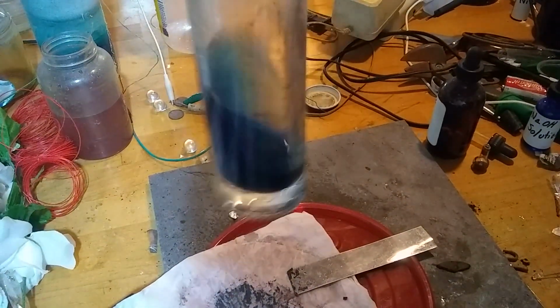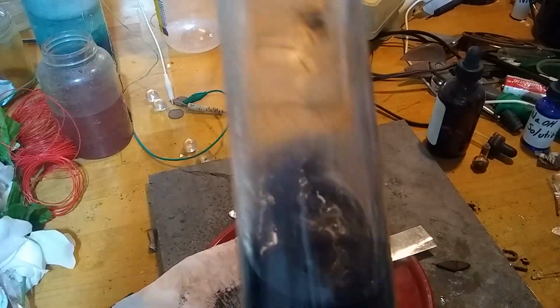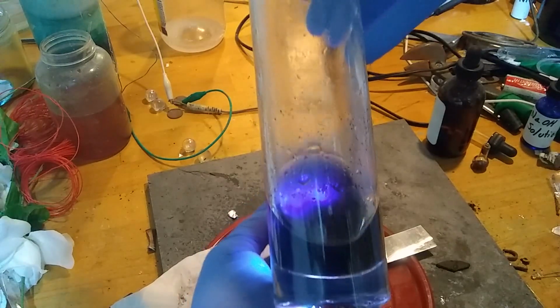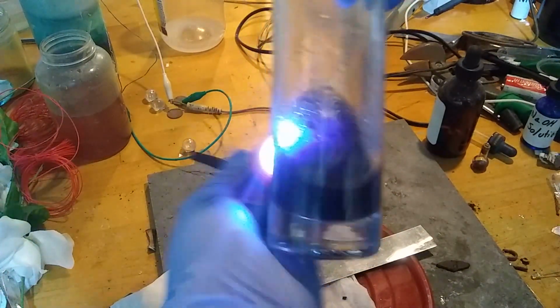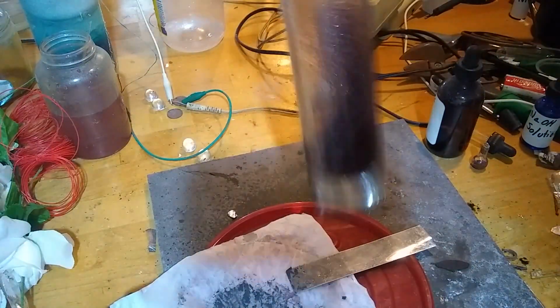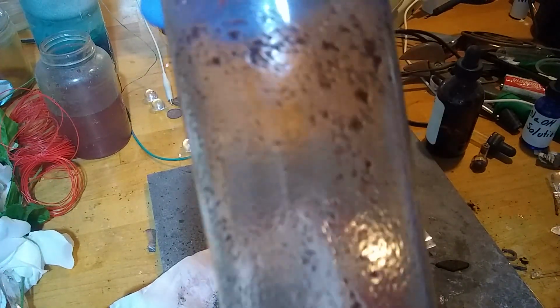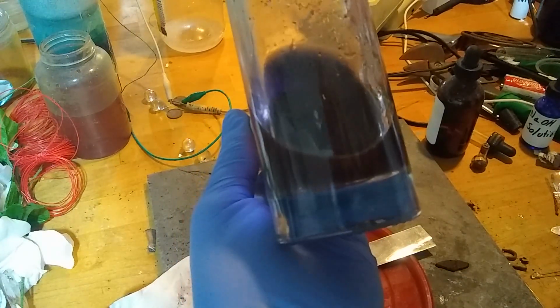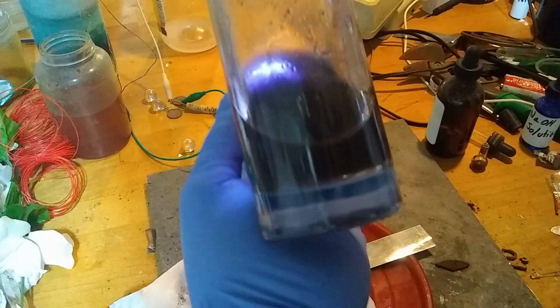The solution has already gone from royal blue of copper sulfate to looking almost black. There you go. From the cobalt that's gone into solution, it's turned purple because it hasn't displaced all of the copper yet. Now as I shake this up, you can see there is copper metal on the surface of the bottle now that the cobalt has displaced it out of solution. But there's enough stuff suspended, it's hard to show you the color, which is looking a lot bluer on camera than it's looking in person.